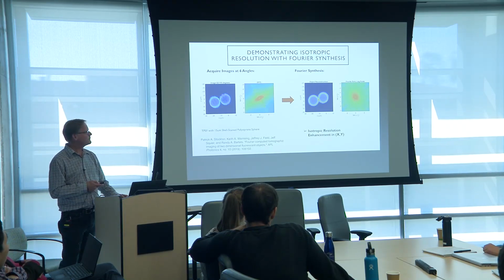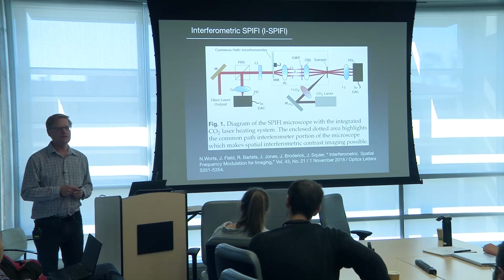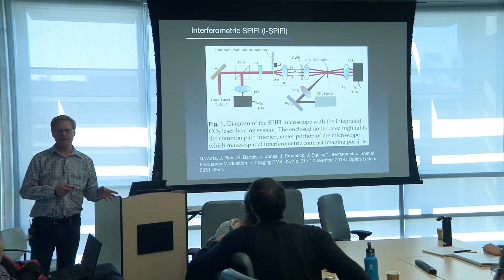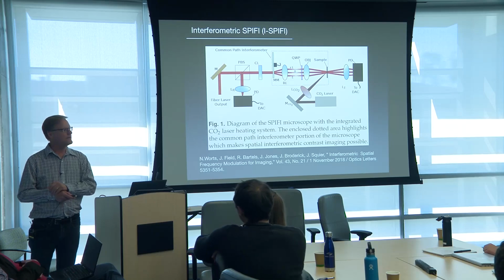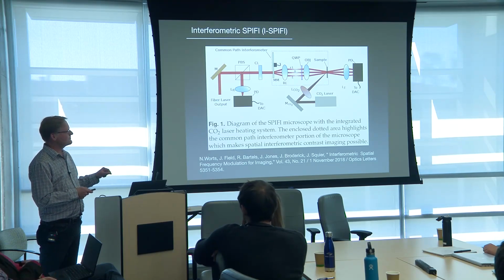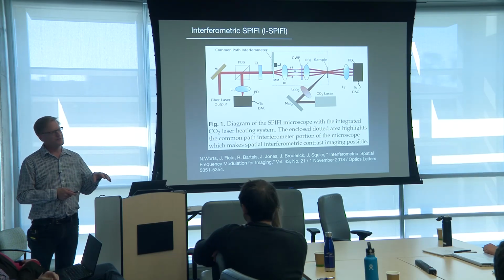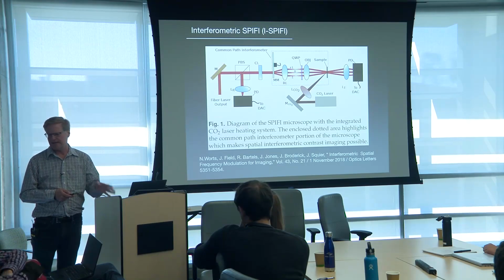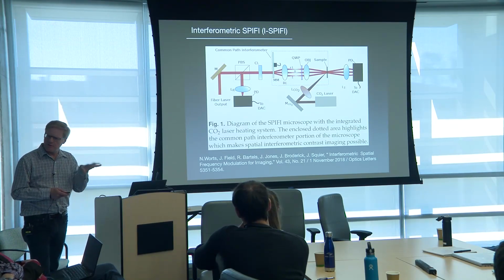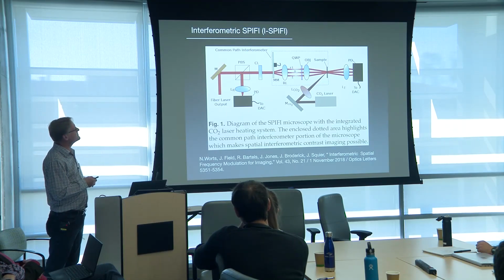What's the computational method to merge those data streams? Yeah, so it's slightly different than traditional tomography. We call it Fourier computed tomography, and again, maybe that's something we can go over here. It's just a little bit different, but it has a couple of steps you have to interchange, because of where we start out. But it's really just drawn from the tomography folks.